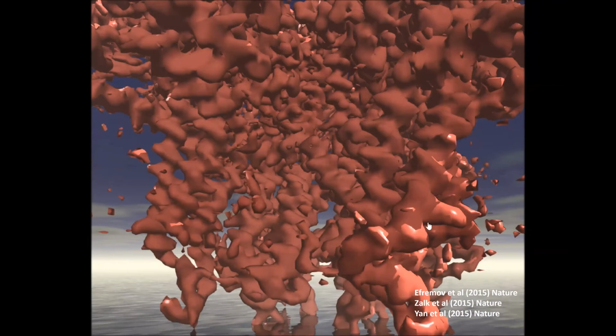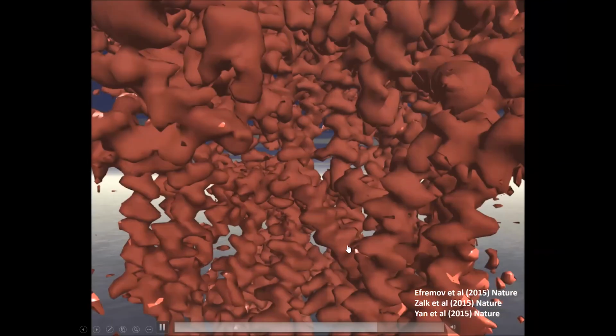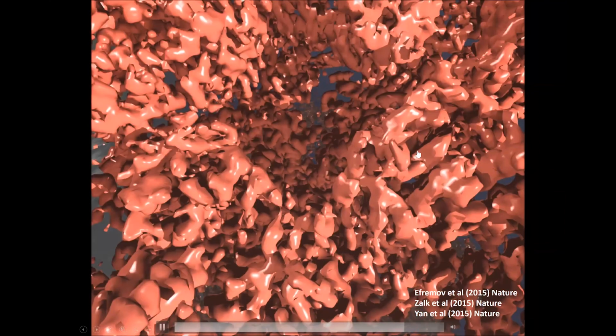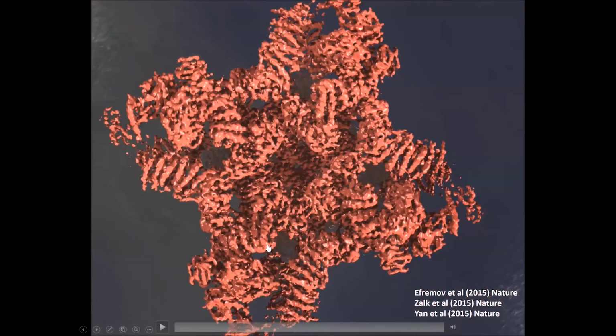So the transmembrane region here is very well resolved. You can see all the alpha helices. In general, you can already see by looking at these cylindrical densities that the Ryanodine receptor is rich in alpha helices in general. Now, this is a big protein, and if I want to talk to you about just the structure, I could fill an entire talk just talking about all the details, and it's a bit of a daunting task to do as well. So I just want to simplify the architecture a bit.